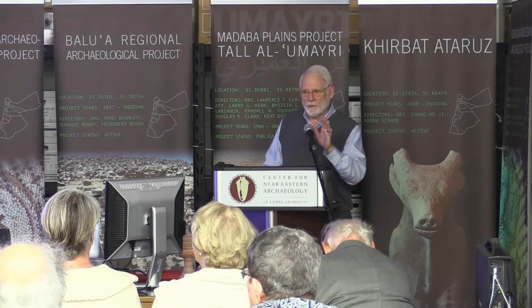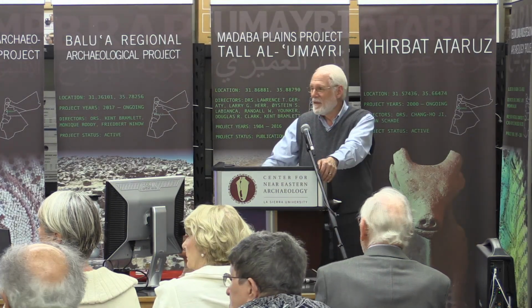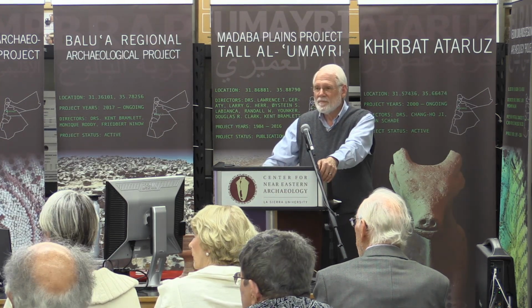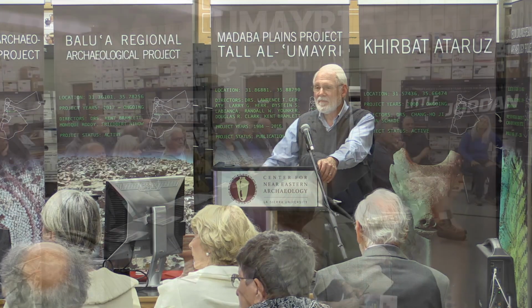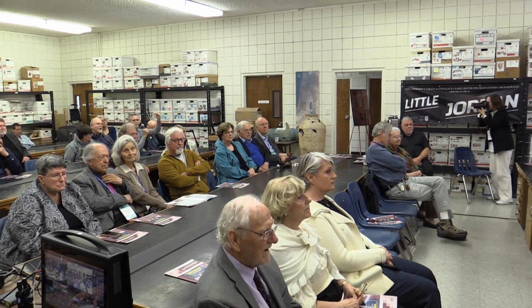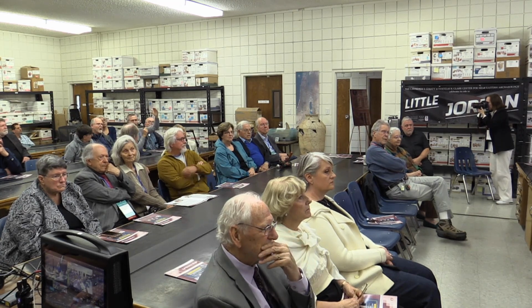Any questions you would like to ask them? So, Dr. Helbley, would you tell us a little bit about the scale at the bottom of that spectroscopy? I assume that was something to do with energy when you were measuring the various energies of electrons. And also, was that an attenuator of some kind that we're using to prompt the peaks to be elevated like that?